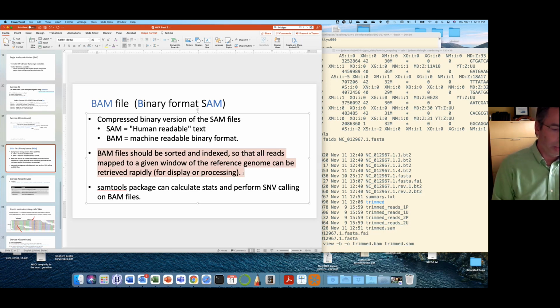Okay. Now we're going to have to sort that thing because if you remember when we did our mapping, the -p 64 spread it out over 64 cores on our machine, all running in parallel. So we were mapping 64 things at a time, and that helped things run much faster. But it also means that as those matches were happening and being added to the SAM file, they get all out of order in relation to where they are located in the genome or where they were located in the read file. And so what we're going to do is reorder that by sorting the BAM file.